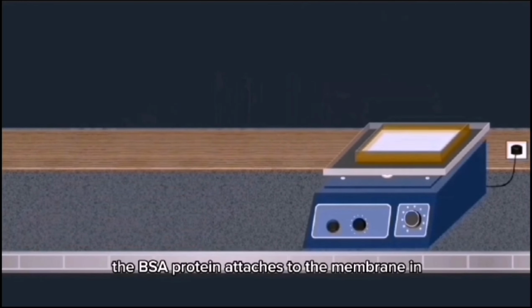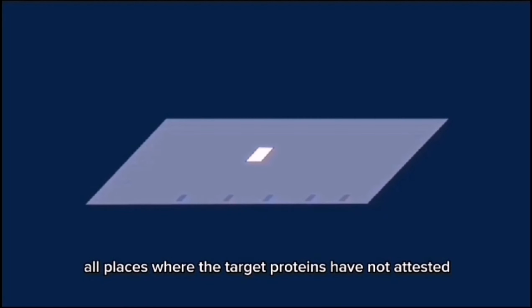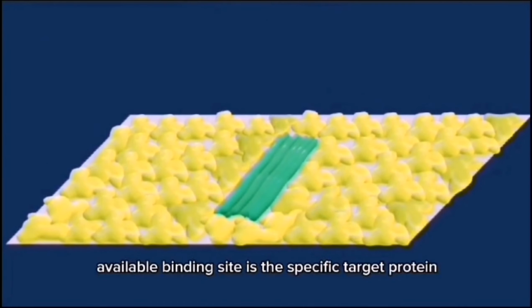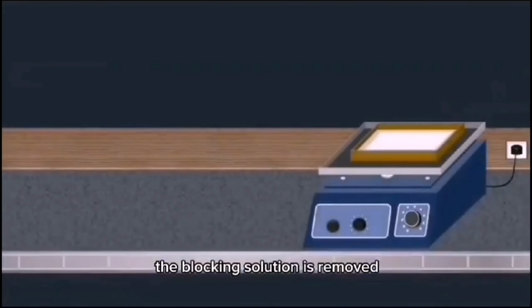The BSA protein attaches to the membrane in all places where the target proteins have not attached. Thus, when the antibody is added, it cannot bind to the membrane, and therefore the only available binding site is the specific target protein. After the incubation is complete, the blocking solution is removed.